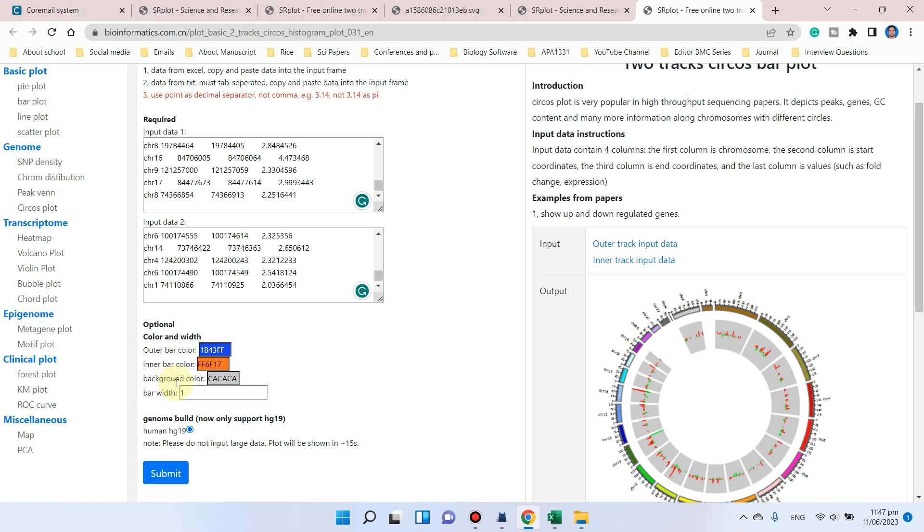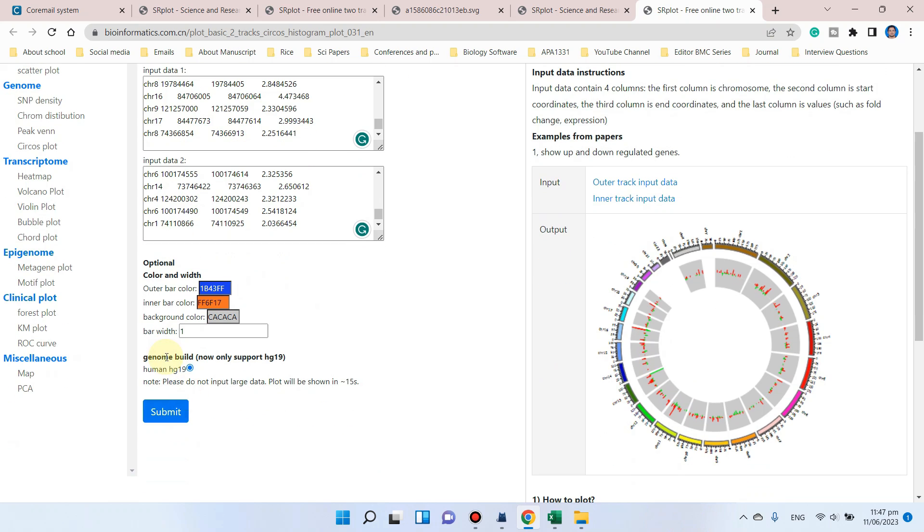Similarly, we can also choose the background color and the bar width if we like. Currently, this circle plot is only available for the human genome. Hopefully, this website will be updated for other genome species as well. After that, you can simply click on the submit button.